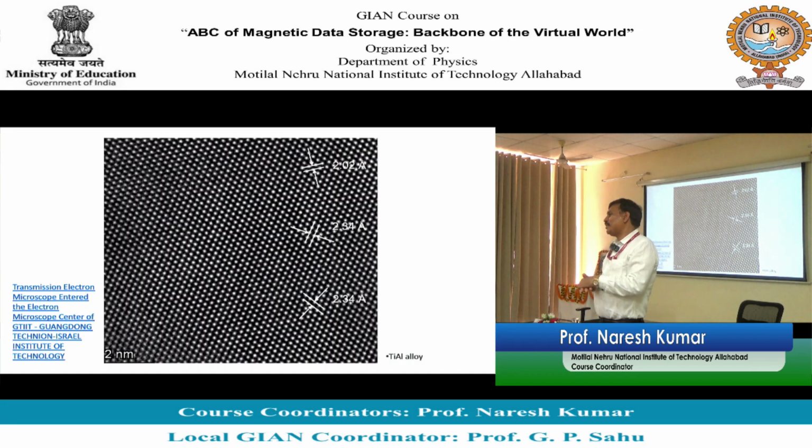Now in nature, if you look at the material, there are two types of materials. One is amorphous, one is crystalline. Crystalline means your atoms are arranged periodically. So one atom, after a certain distance, another atom. So these atoms are so nicely, so systematically arranged कि it behaves as if it's a natural grating. एक nature ने आपको एक N slit दे दिया है.